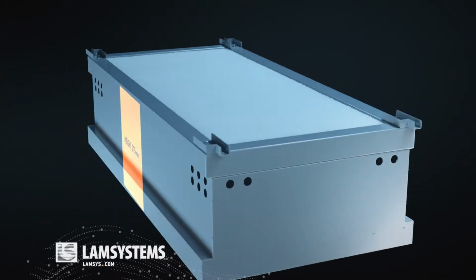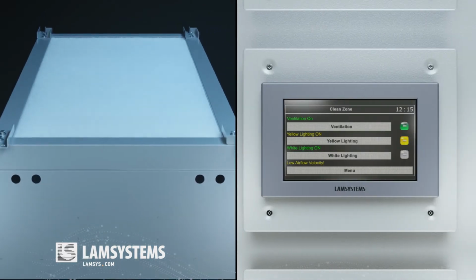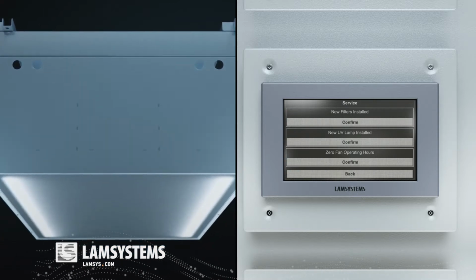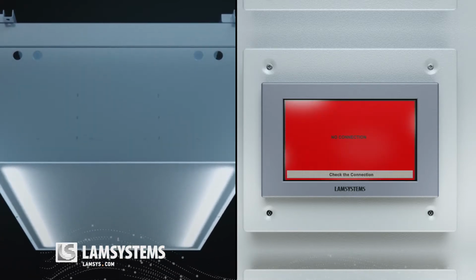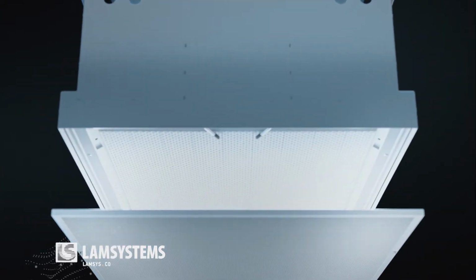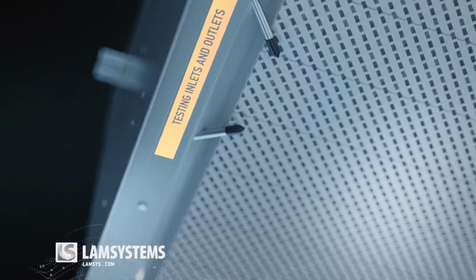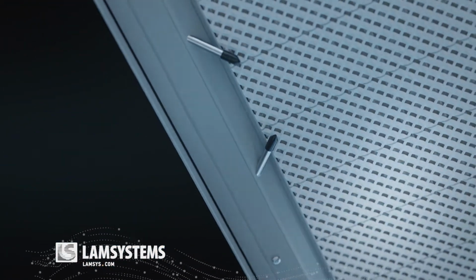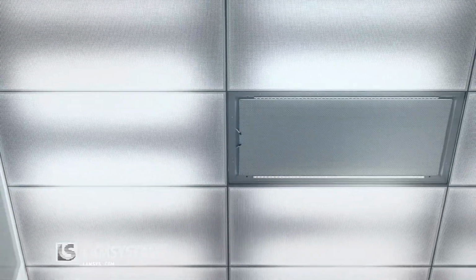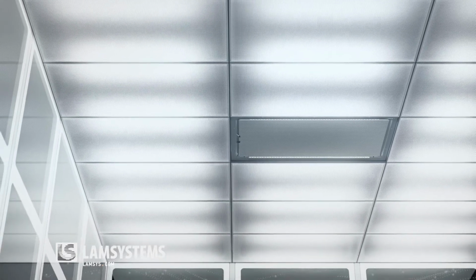An electronics module controls the fans, maintaining the airflow velocity independent of the level of filter clogging, controls the lighting, indicates when filters need to be cleaned or replaced, generates an alarm in case of emergency situations. For HEPA filter and its sealing integrity testing, there are special inlets for testing aerosol supply to each fan and outlets for sampling the air from the positive pressure plenum. Location of the inlets and outlets allows carrying out all the necessary procedures inside the clean zone.